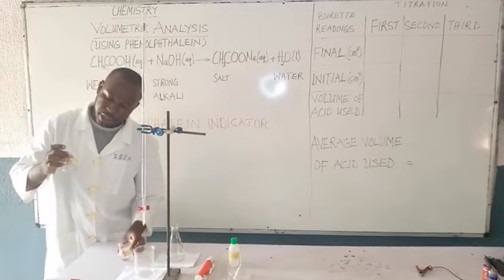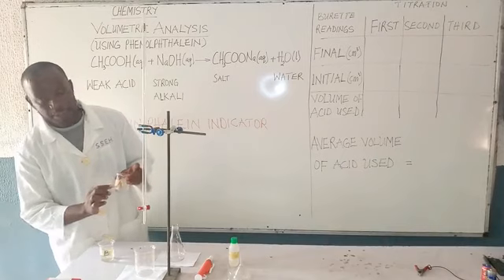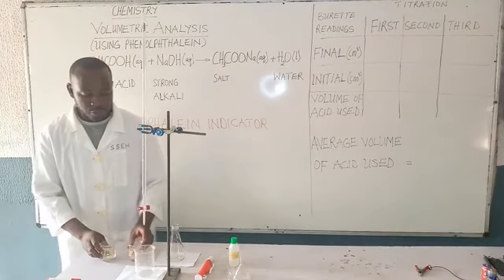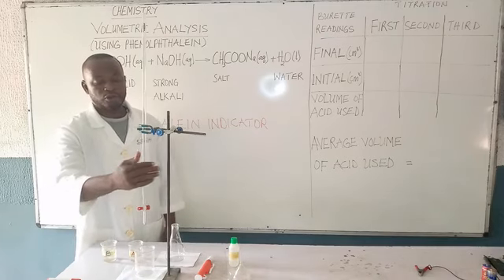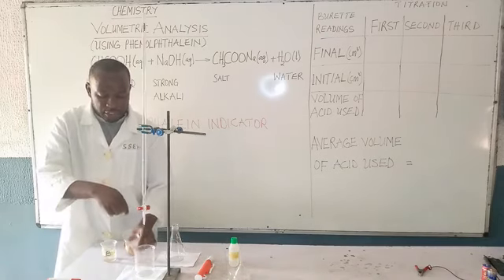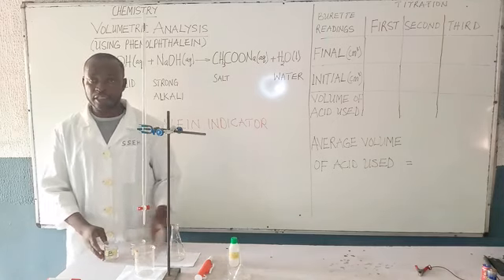And these two containers here contain solutions. The solution, as you can see here, B, that is a base, a soluble base, and here A, it means an acid is contained here. So in chemistry, the materials we can touch, you call them apparatus, but the substances like this, we'll call them reagents. Do you understand?